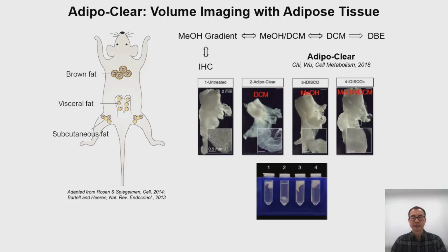It could rapidly accumulate during injury and aging. Therefore, if you use AdipoClear to clear a brain, you can also get more superior clearing performance. Together with other improvements, AdipoClear preserves the tissue antigenicity very well, so that now the majority of IHC-validated antibodies are compatible with our whole-brain procedure.